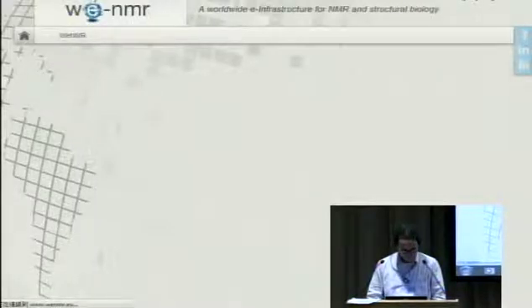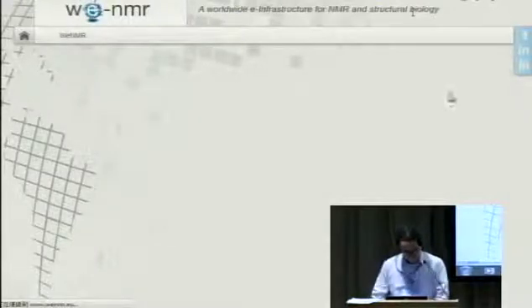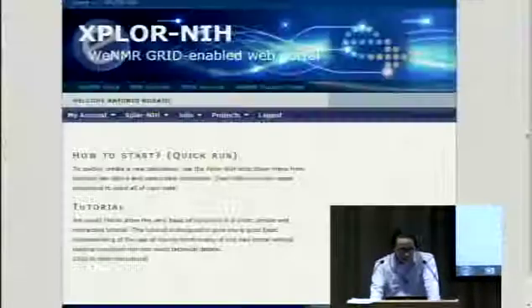Slowly. Try again. Let's go via Google. No, it's gone.